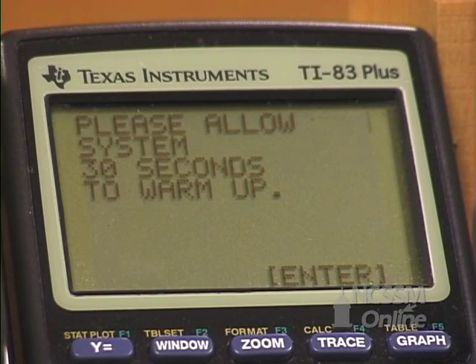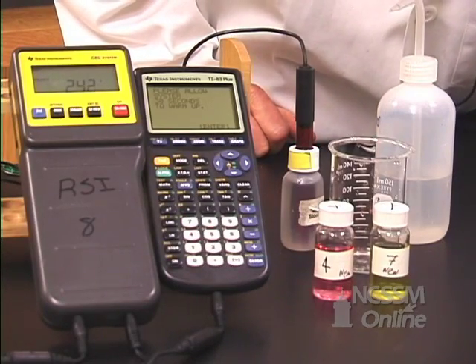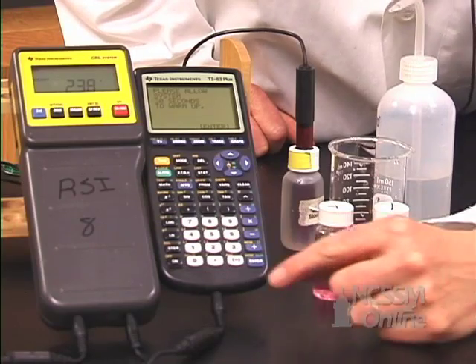It says to wait 30 seconds for the electronics to warm up. So we're going to wait 30 seconds and then press enter.